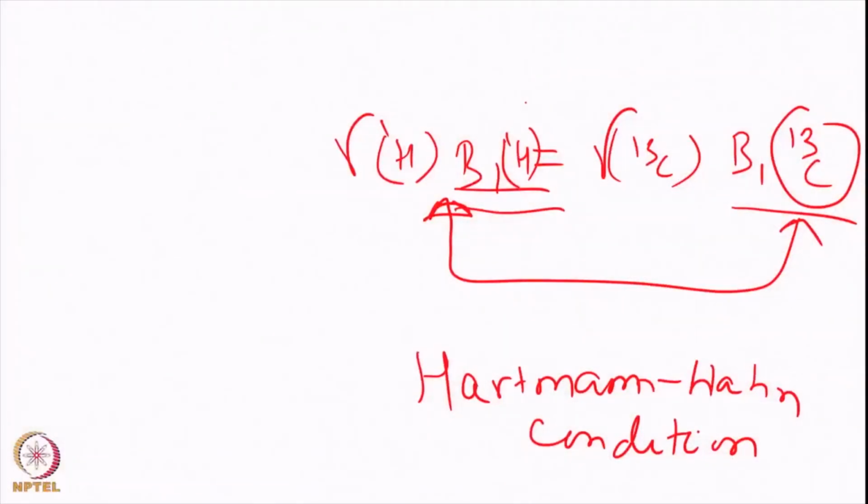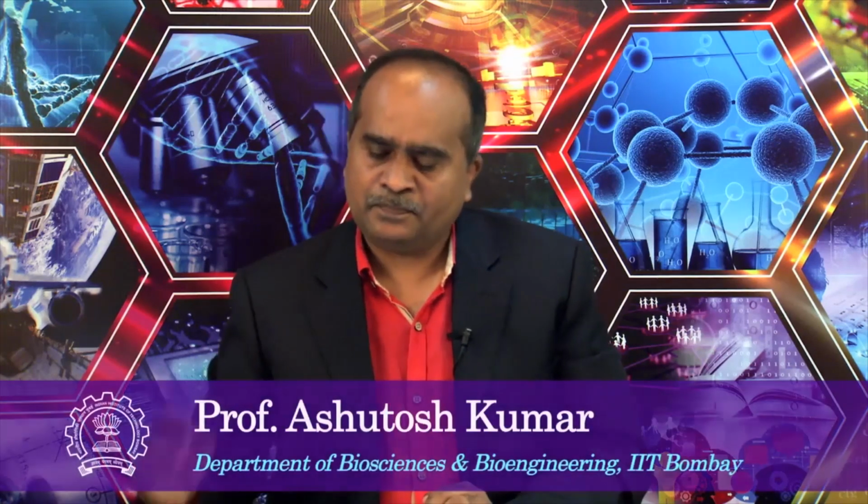This trick we will discuss a little more quantitatively in the next class, where we learn how to do this transfer. I mentioned that we are going to match this condition in selective polarization transfer, by spin locking and matching the Hartmann-Hahn condition. We will continue from there and discuss the 1D ROESY experiment and the 1D TOCSY experiment for transfer from proton spin to coupled X spin.